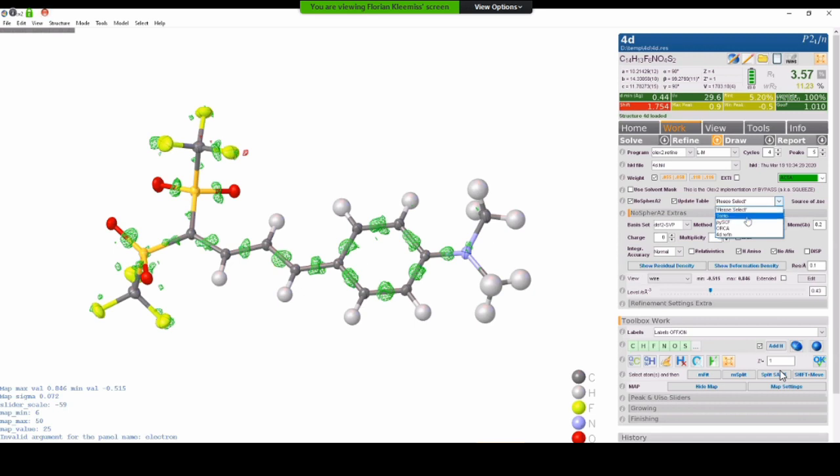There is plenty out there. The, let's say, house code that is delivered with Olex2 is Tonto from Dylan Jayatilaka from Perth. That can do wave function calculations for you. PySCF is a code that is freely available and open source that you can just get by, for example, typing pip install PySCF on your computer if you have a Mac, for example. So it's easy to install and it's free. Everybody can get it without any restrictions.